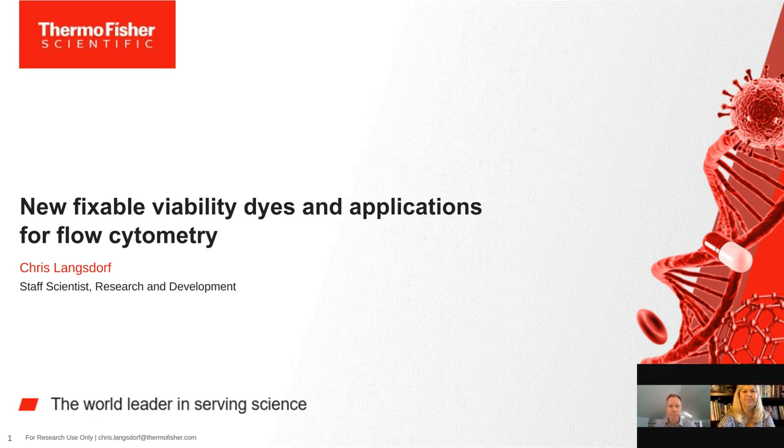So Chris, our first question coming already in from our great audience is, I would like to add a live dead fixable viability dye to my spectral flow panel. Can you provide any more guidance on how to design this panel?